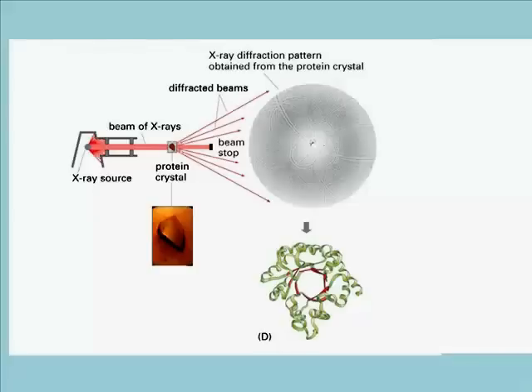Once a protein is pure, it might be possible to crystallize it and subject the crystal to X-ray diffraction or X-ray crystallography. Well, making the crystal is the first step, and sometimes it's very tricky. There are actually many proteins that cannot be crystallized. But for those that can, the next step is to beam X-rays through the crystal and capture the pattern of X-ray diffraction on an X-ray film.